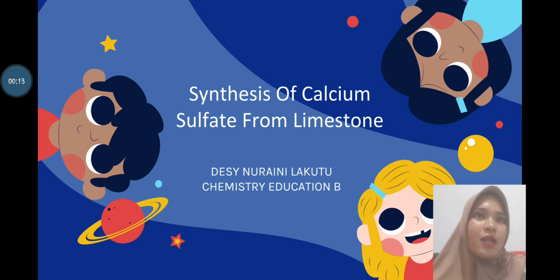My name is Desi Nur Aini Lakutu. I'm studying at the State University of Gorontalo from the Department of Chemistry, Study Program Chemistry Education Class B. This time I will explain the results of the practicum module: synthesis of calcium sulfate from limestone.